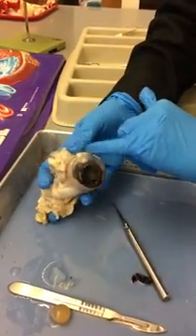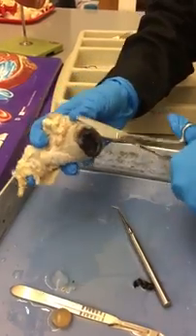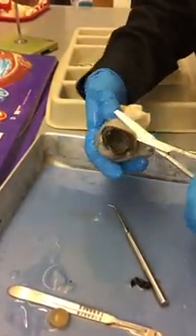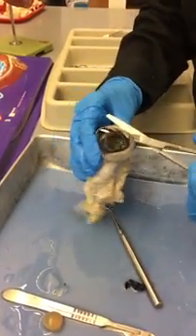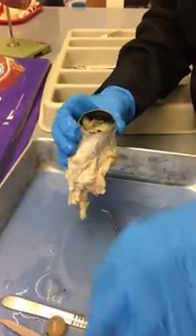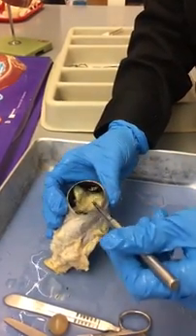Now I'm going to gently cut around the sclera so we could see more of the posterior segment of the eye. Okay, so I managed to keep the retina on. Here's the vitreous humor, more of it.